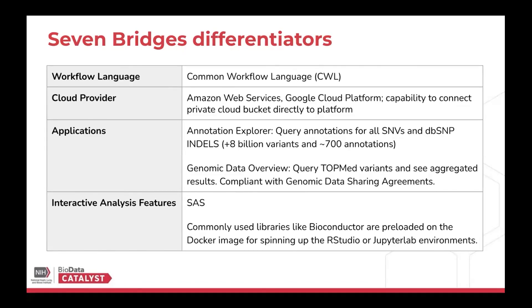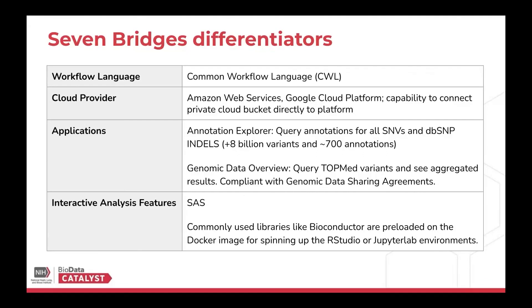One application that's unique to the Seven Bridges is the Annotation Explorer. So this is a great way to browse the TOPMed data annotation. So you can actually browse through 8 billion variants and up to 700 annotations using an interactive web page. So this is a great way to filter down for SNPs that you're interested in pre-GWAS and create aggregate units to run an aggregate GWAS, as well as post-GWAS. You can use those for annotation.